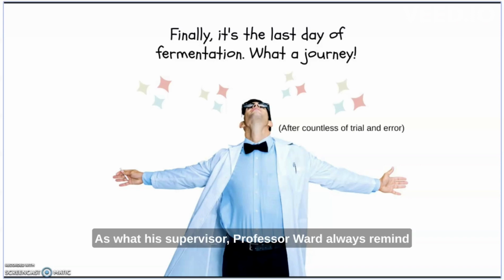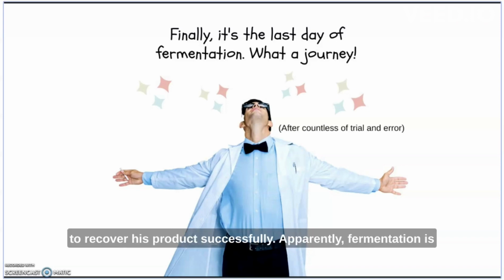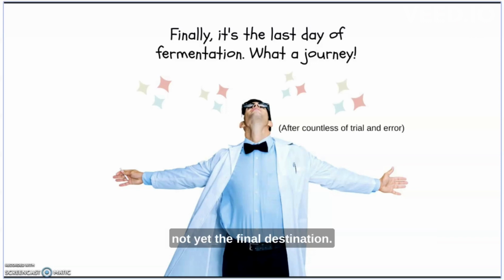As his supervisor, Professor Ward, always reminds him, to make the microorganisms happy is to know what they like the most, and this includes their food. Now, his next mission for his FYP is to recover his product successfully. Apparently, fermentation is not yet the final destination.